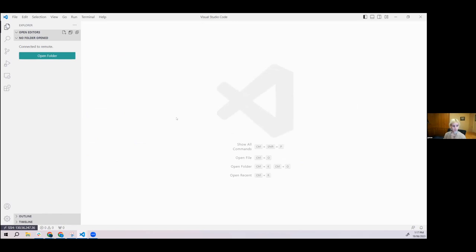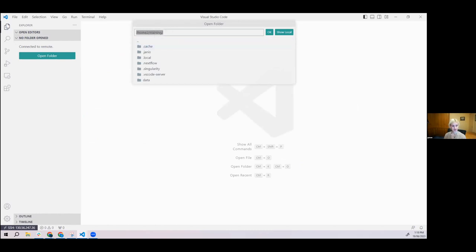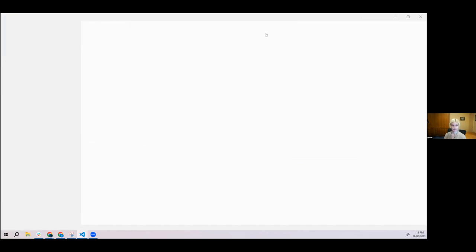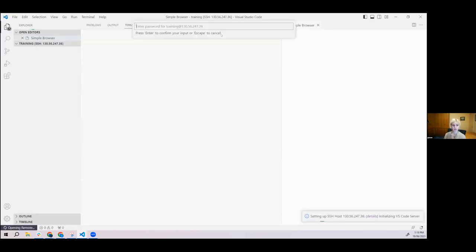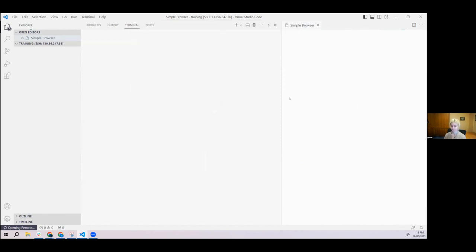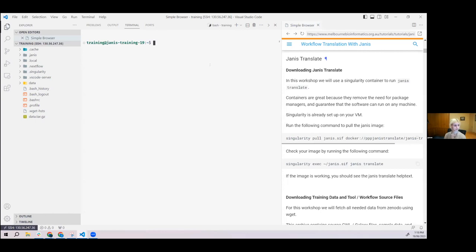When you first log in, you haven't opened a folder yet. Go to the top left Explorer and click Open Folder. The one that pops up by default is the one we want, so just press OK. If it prompts for your password again, just paste it in. If everything's been set up correctly, you should see something like a data.tar.gz file as well as some other miscellaneous things in the home directory.